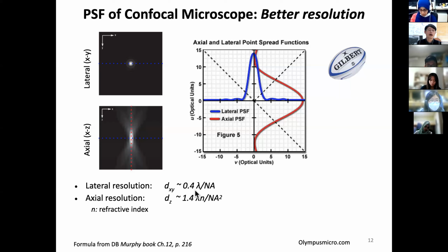And this allows the confocal microscope about 40% improvement of lateral resolution. So that's why biologists love confocal. While this is so big and expensive, before it was a $500,000 apparatus, now it gets down to probably 0.2 million, or 200K.